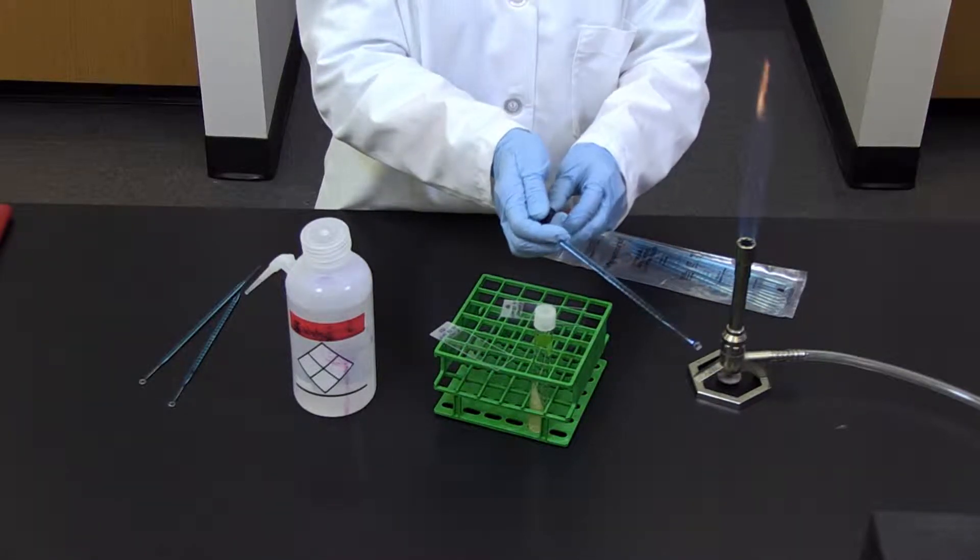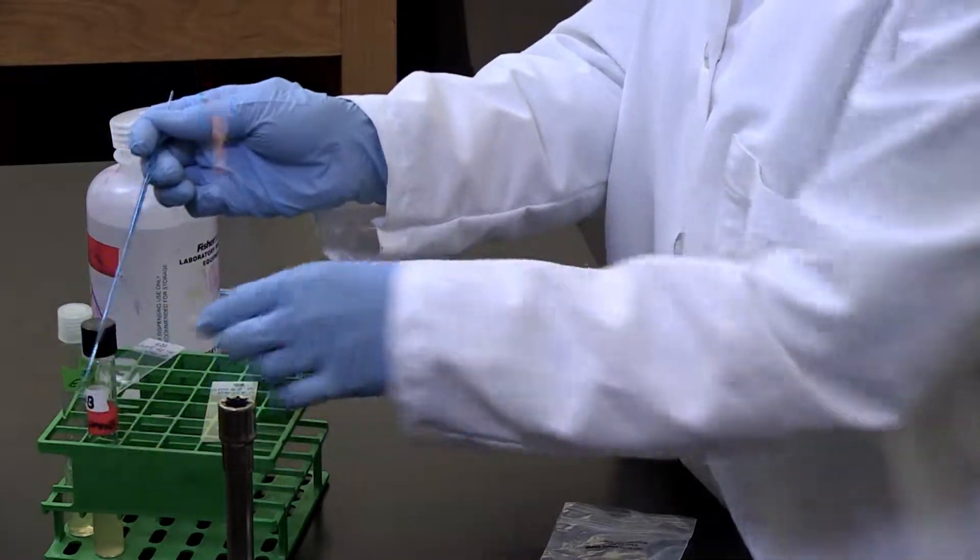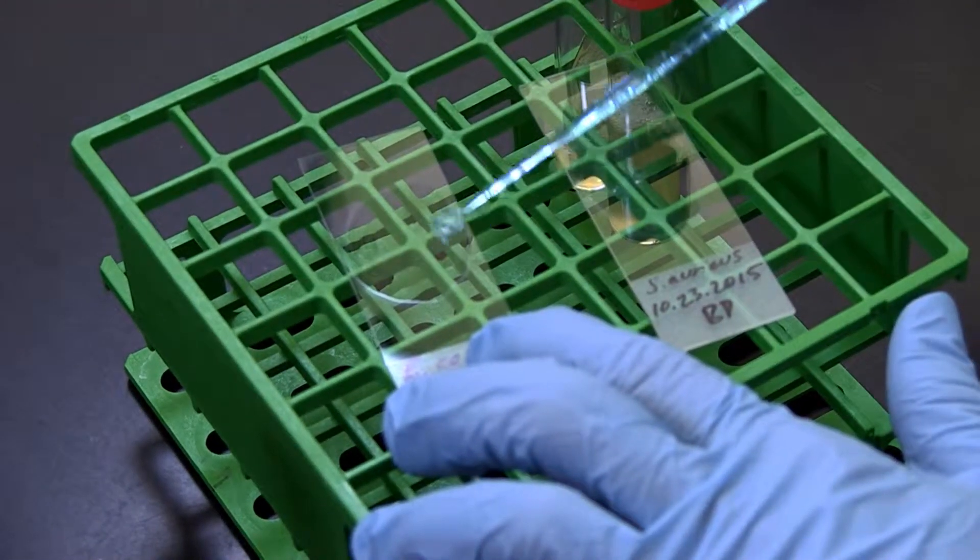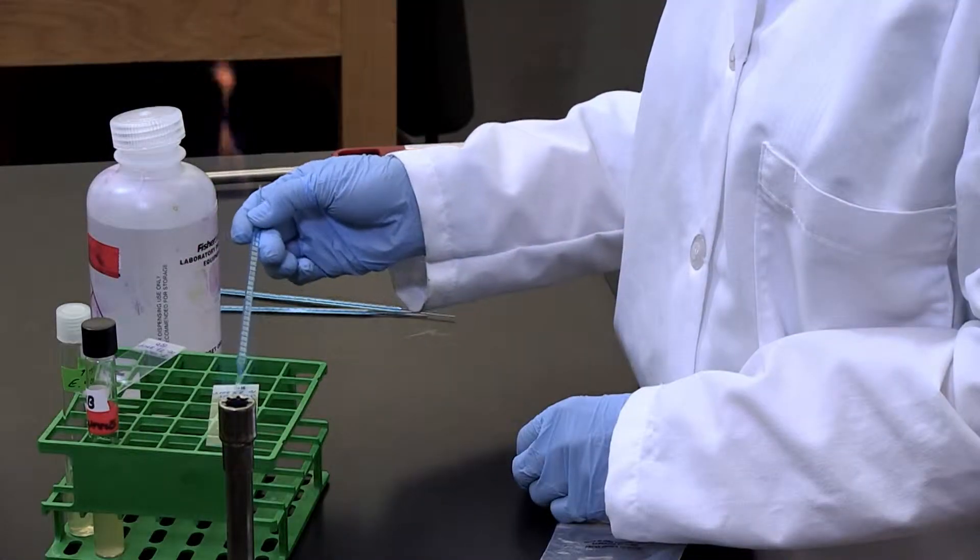Next, aseptically add two loop fulls of the culture to the center of the slide and use the loops to spread it over the slide. Cover an area about the size of a quarter.